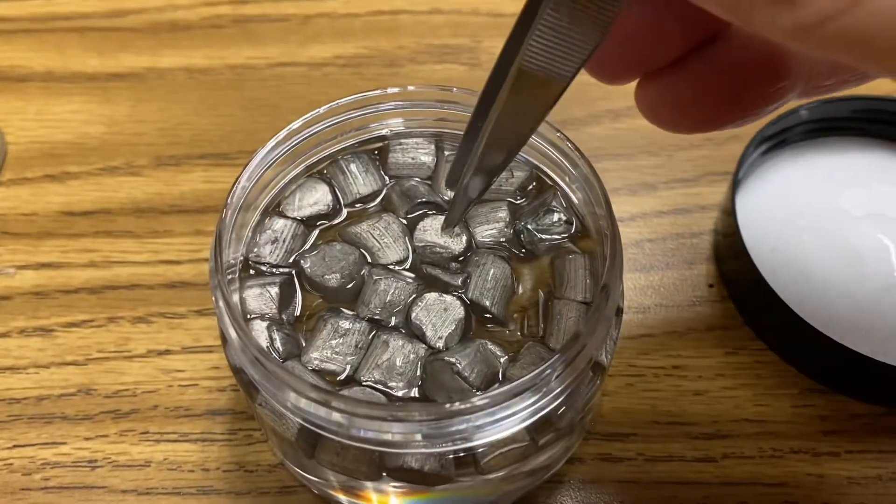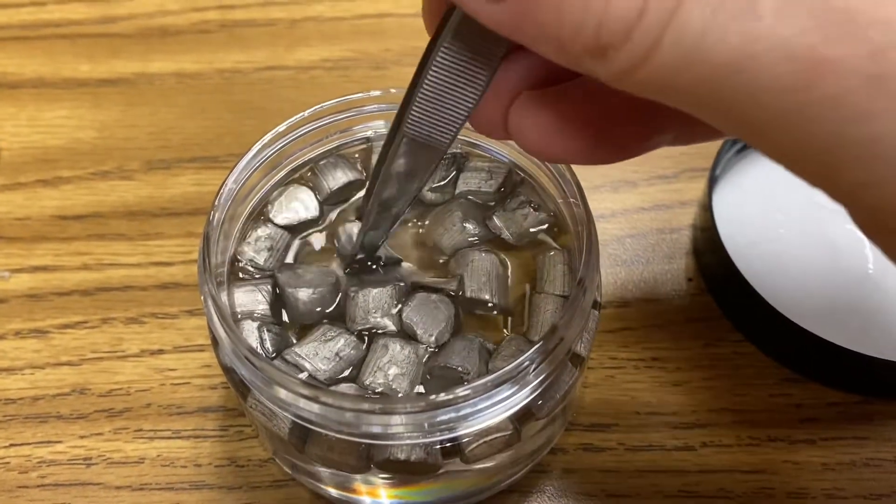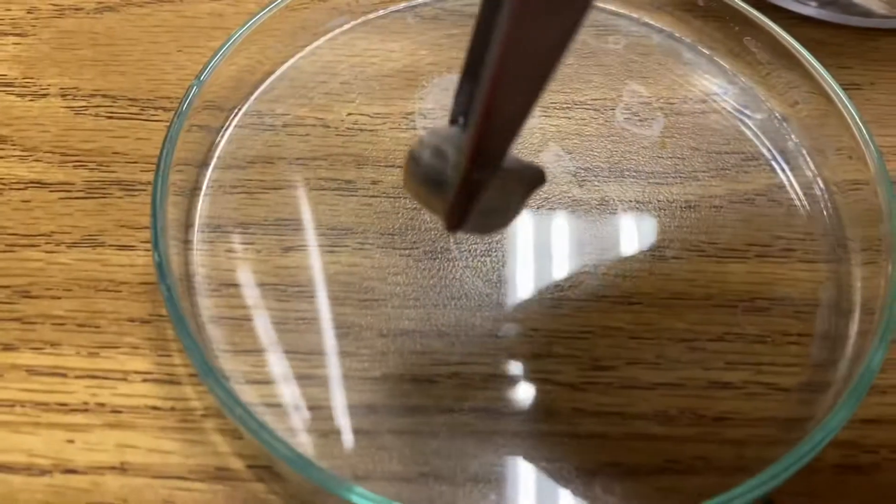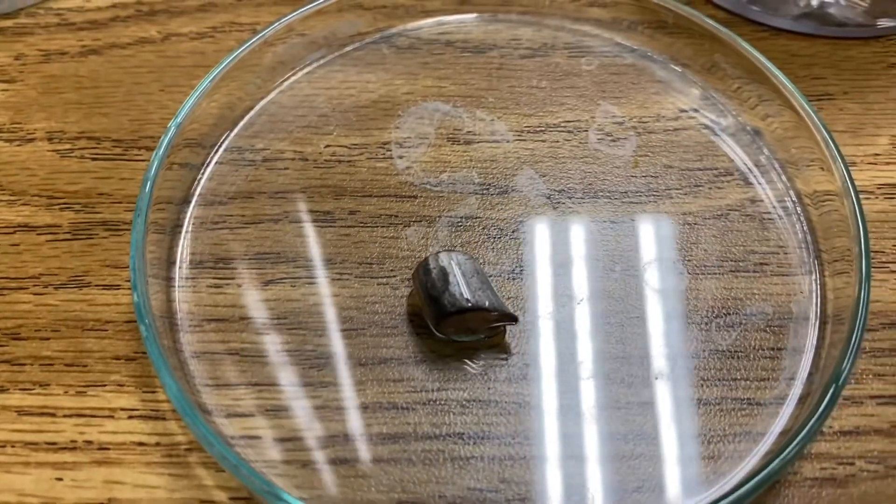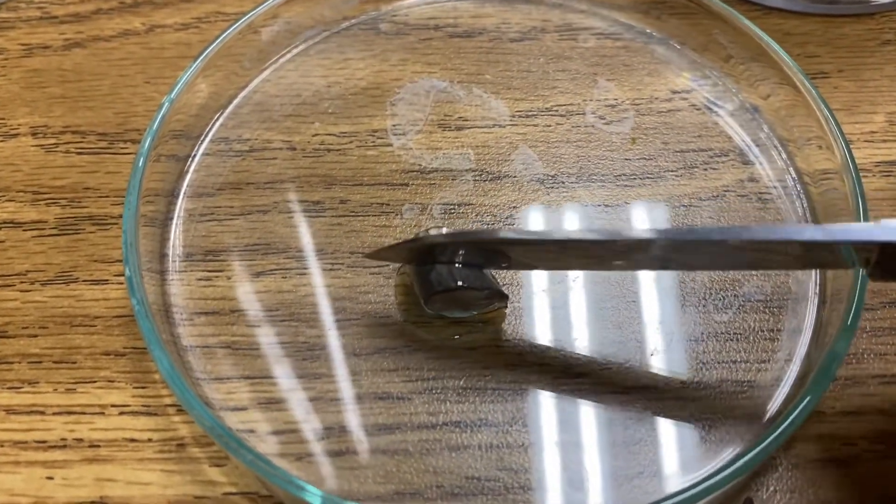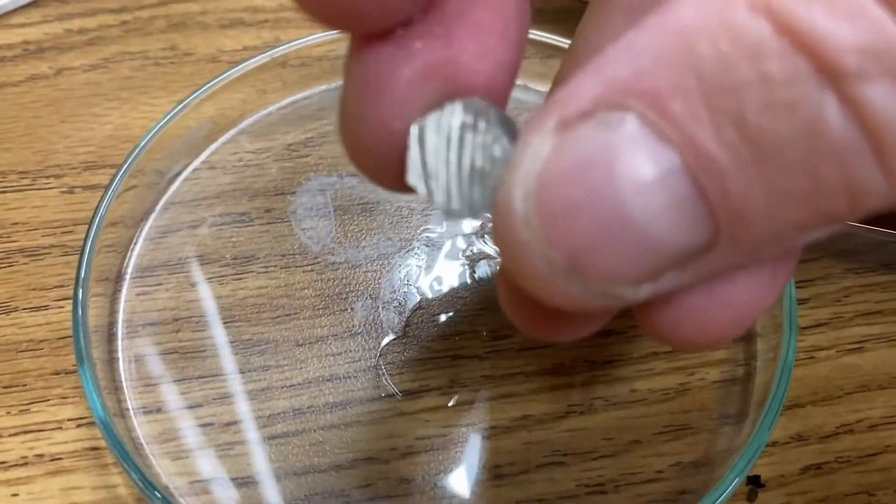Lithium is an alkali metal that's so soft you can cut it with a knife. Here's a small piece and when I cut it you'll see what it looks like beneath that oxide layer. Wow, look how shiny that is.